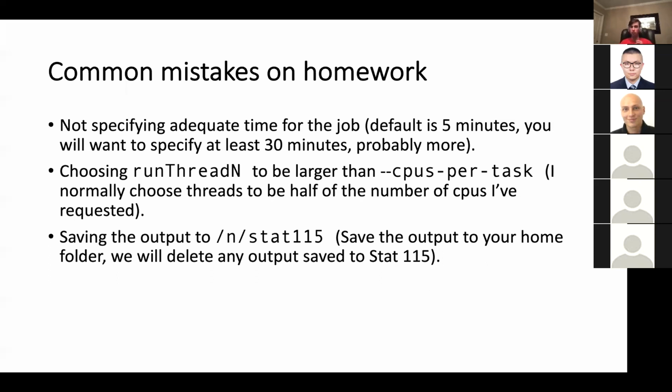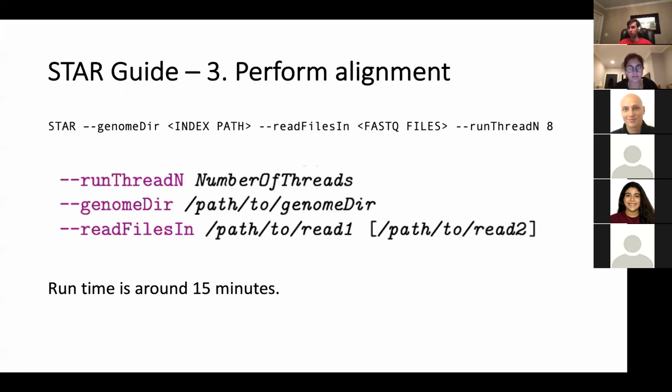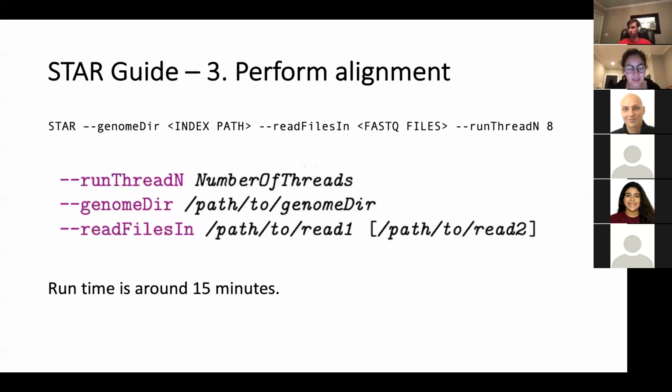Yeah, I know, but how can I change that? So the easiest way is to run the command STAR in your home directory. And then when it's time to specify the genome directory, you give the absolute path, which is here. Okay, that's what I recommend. Thank you.